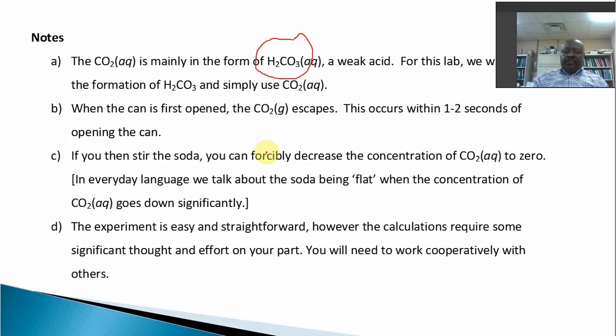And then I wait. Then I put in a stir bar and gently stir. First gently, and then as you go on more and more vigorously, the carbon dioxide that's left in here goes out. And eventually, you can get all of it out. Carbon dioxide is leaving. That must affect the mass, okay? All right. Suppose that's done, and I wait.